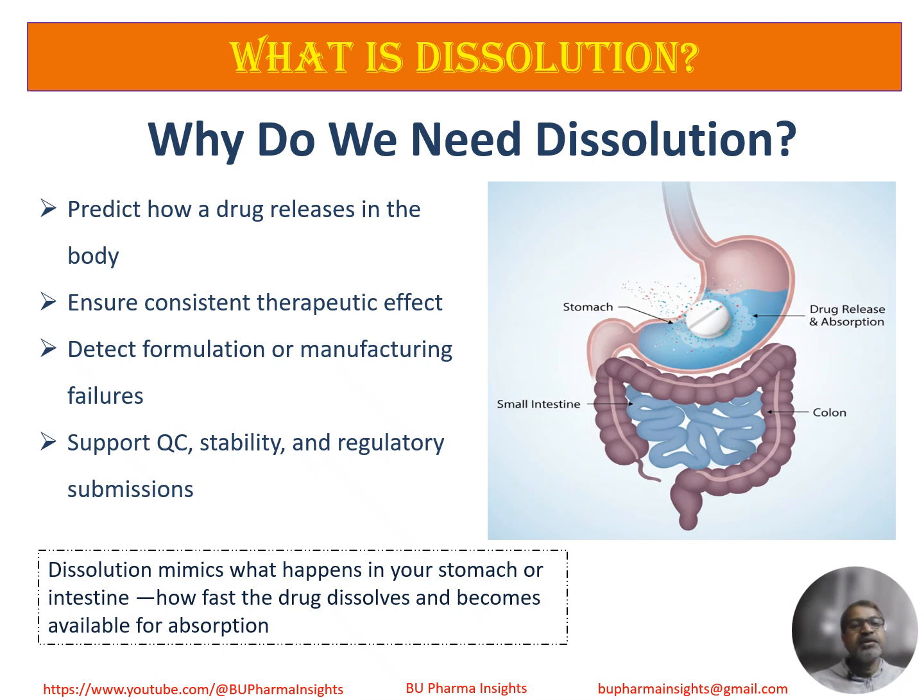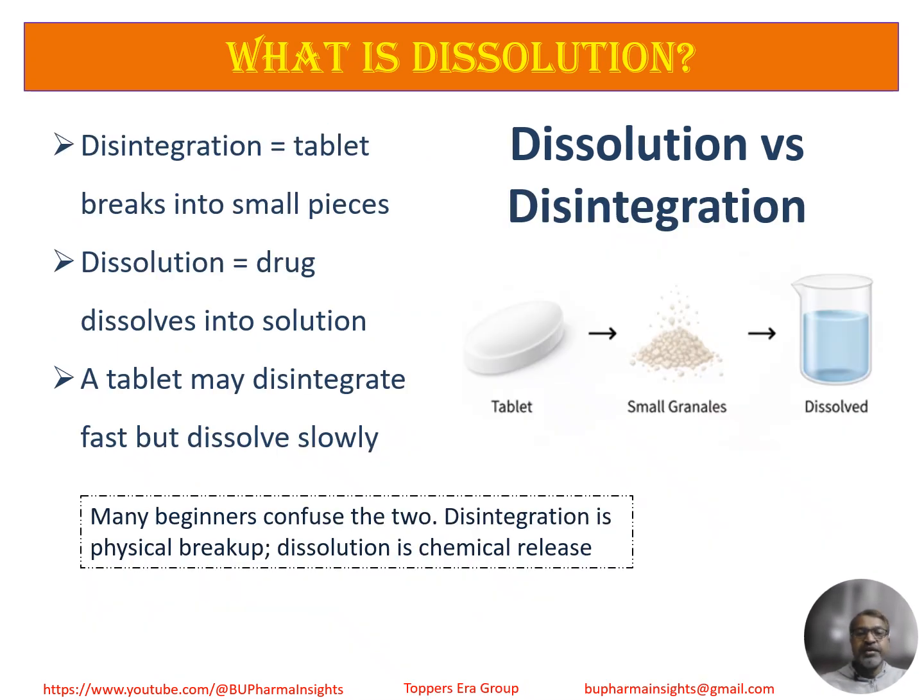It helps ensure the product is safe, effective, and consistent, while also allowing us to identify formulation issues early, support regulatory submissions, and confirm performance during stability. In simple terms, dissolution mimics what happens in the stomach or intestine, how quickly the drug dissolves and becomes available for absorption.